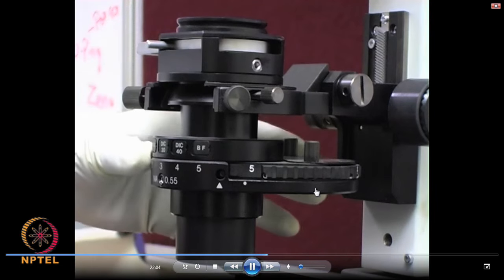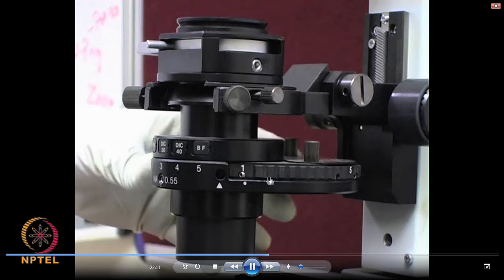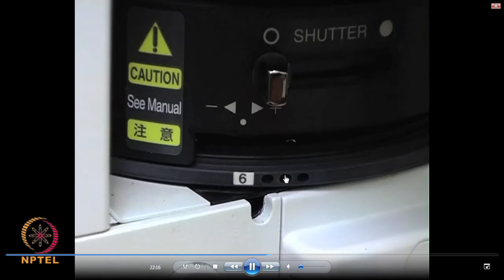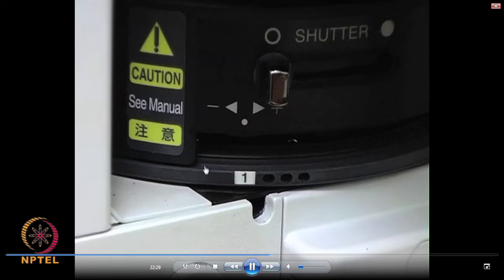When you rotate this condenser apertures and filters, this particular aperture will have the phase plate, the phase plate will be inside. Similarly, here also you will have the phase plate. Whatever we have seen as a phase plate will be kept inside this, along with this condenser apertures and filters. So now look at the images and also see the enhancement in the contrast.